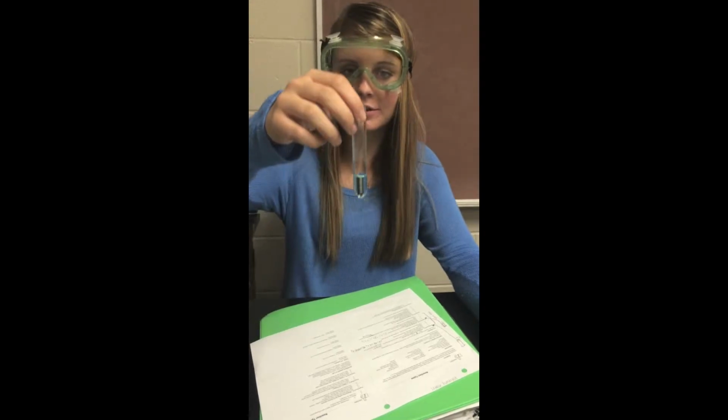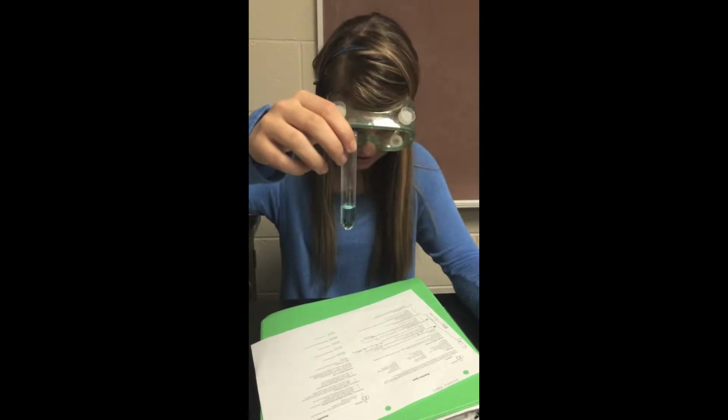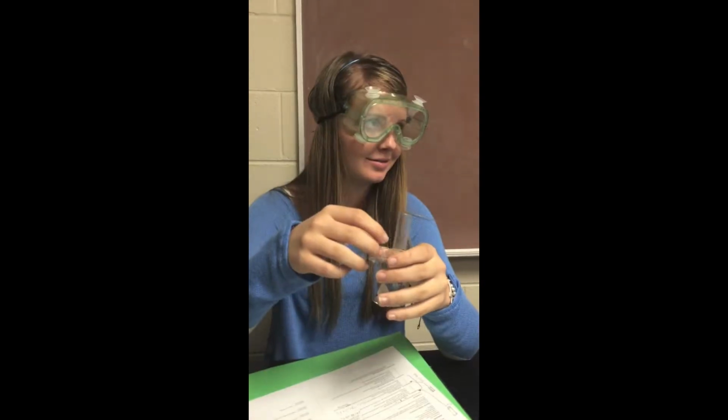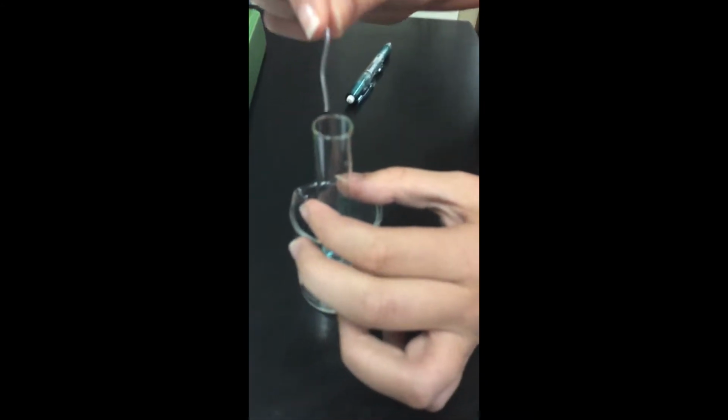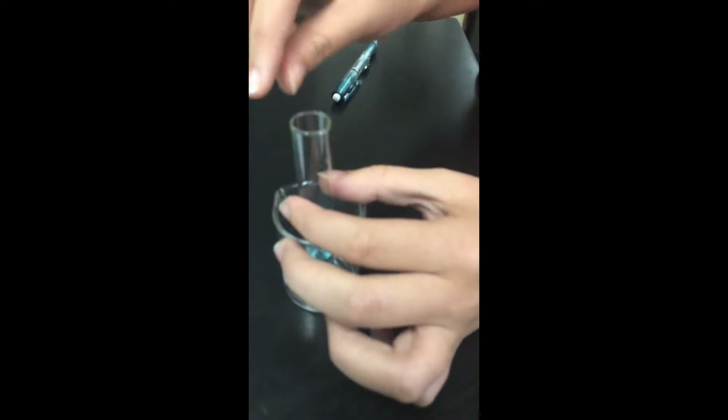We filled a large test tube about 1/4 of the way with copper(II) chloride solution. We then placed it in a small beaker. We then added a small piece of aluminum wire, which was 3 centimeters long, and dropped it into the copper(II) chloride solution.